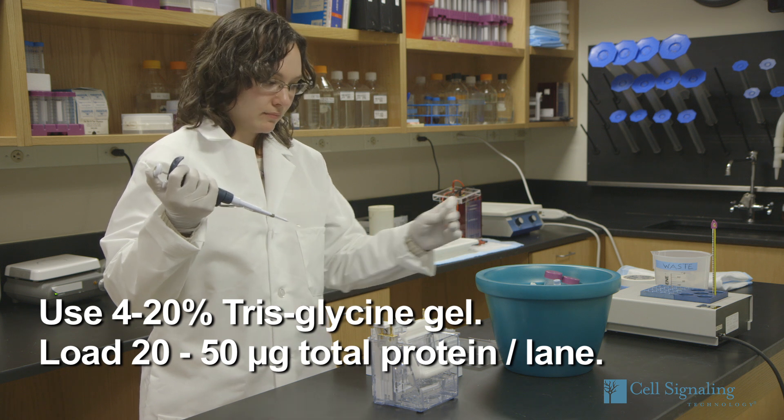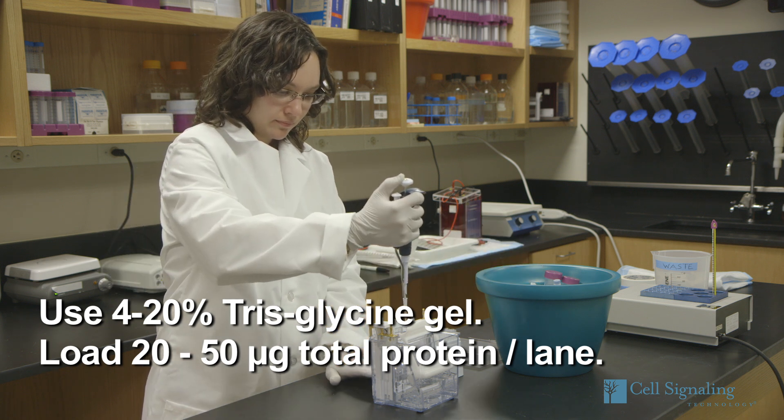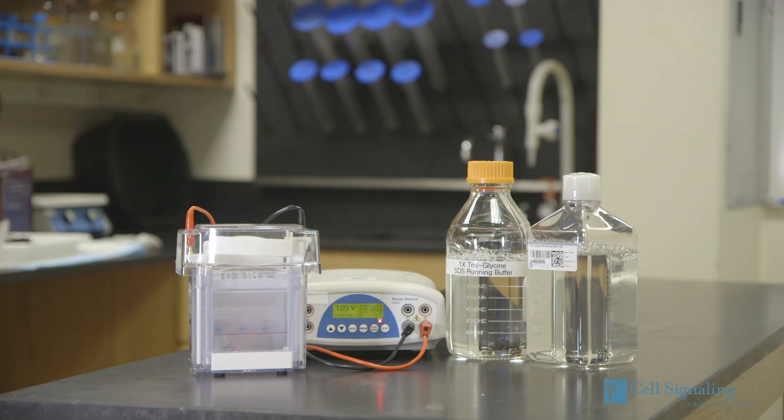Next, load the centrifuged sample onto a square SDS-PAGE 4–20% gradient gel. Alongside the sample, load 10 microliters of the pre-stained markers and 10 microliters of biotinylated protein ladder to determine molecular weights. Run the gel using SDS running buffer.